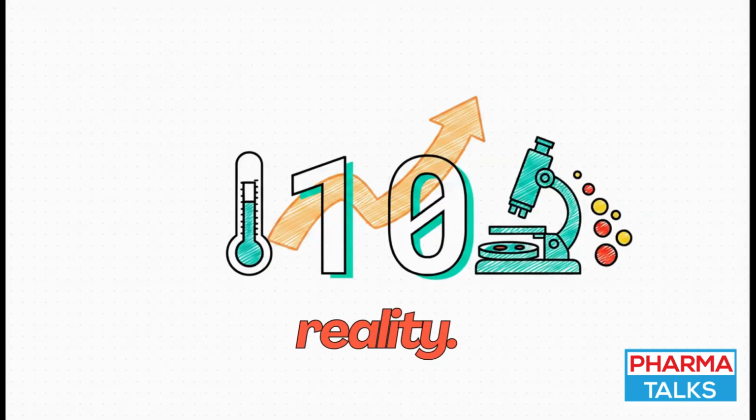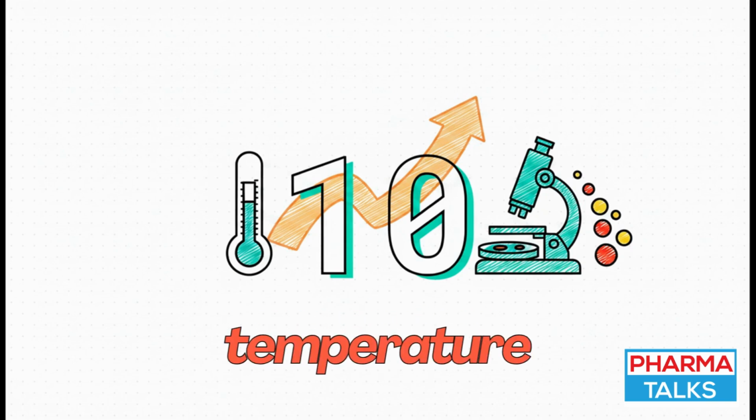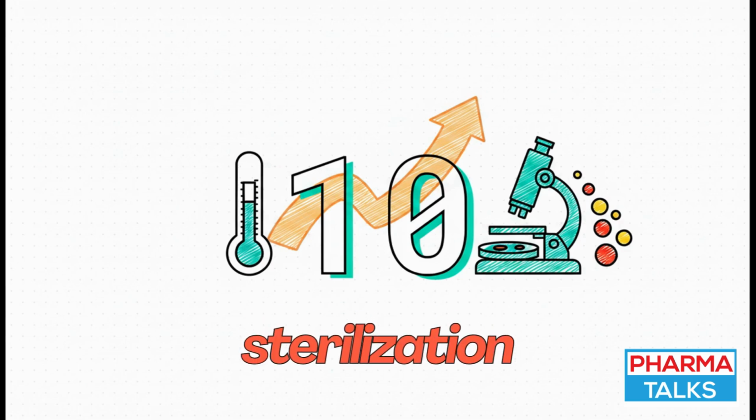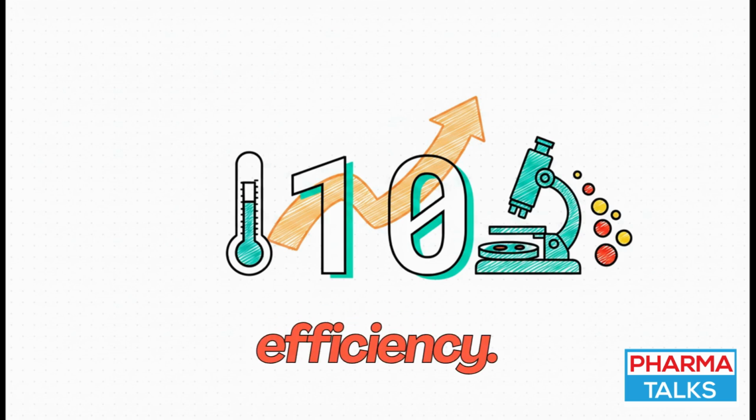Let's ground this in practical reality. Take the number 10. The z-value tells us how susceptible a specific spore population is to temperature changes. For instance, if we know the z-value of a spore population is 10 degrees, then increasing our sterilization temperature by exactly 10 degrees will result in a log reduction of the d-value. That means the d-value drops by one full factor of 10. That is a massive 90% drop in survival rate, achieved just by a carefully measured shift in heat. It's a huge leap in sterilization efficiency.